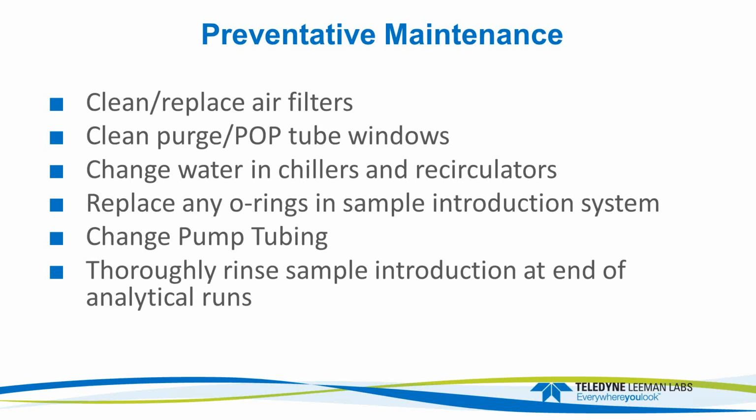I don't take my torches and spray chambers out and clean them on a routine basis. That's because I sort of clean them every day by running solution through them. I think that's really a good idea to do. Your nebulizers aren't going to clog up on you, and you keep everything nice and clean. Generally, instrument software will allow you to run unattended, and at the end, the plasma will go through a rinse cycle and extinguish. Take advantage of that. If you do this preventative maintenance, you'll have a lot fewer problems in your day-to-day work.